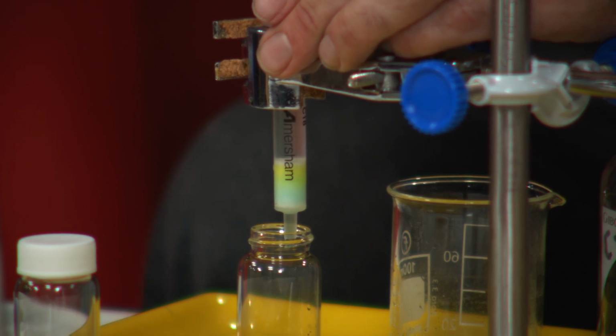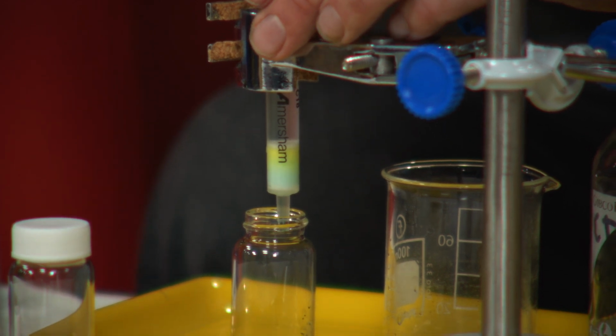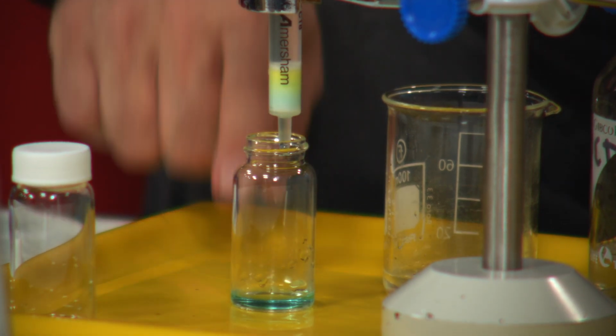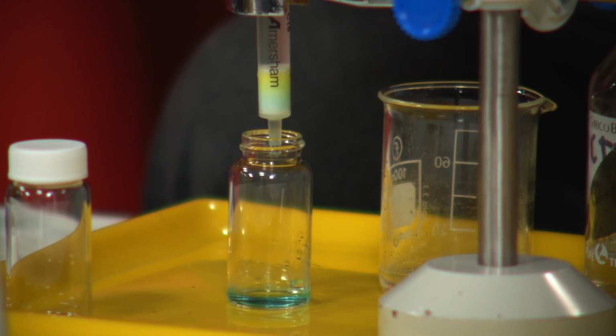So we're separating the blue component of the mixture, yet leaving the yellow component behind. And we can see the blue in the bottom as well. And the blue we're collecting is not 100% pure, but a purer version of the blue with very little of the yellow remaining.